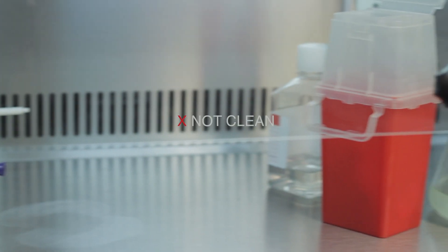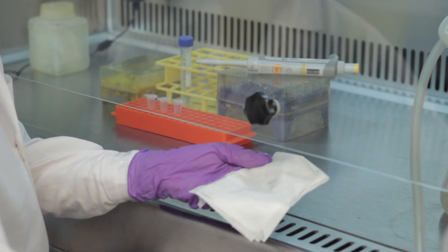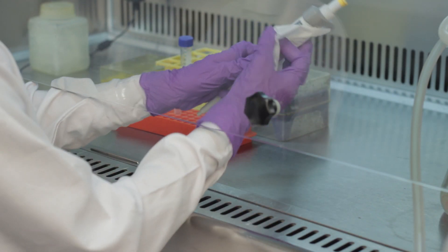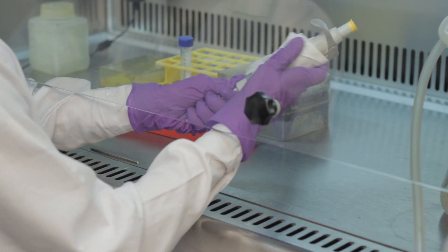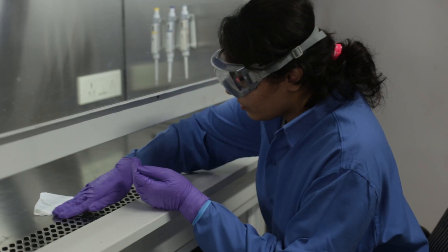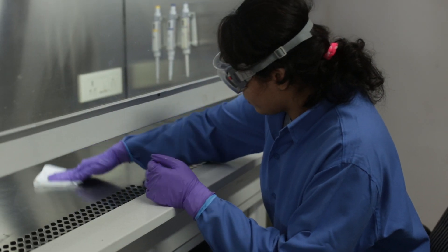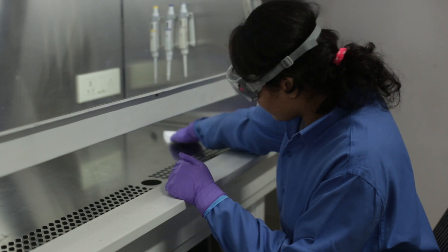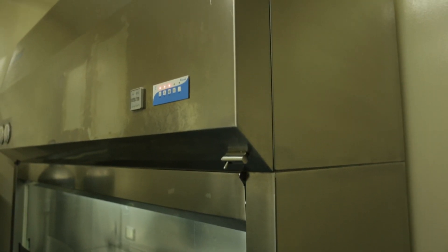Do not mix clean and contaminated items while working in the cabinet. At the end of the work, decontaminate the surface of the items before removing them and also decontaminate the surface of the biosafety cabinet. Biosafety cabinets require periodic maintenance and testing to ensure their efficiency and integrity.